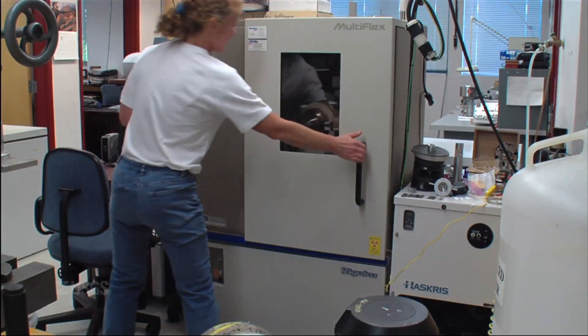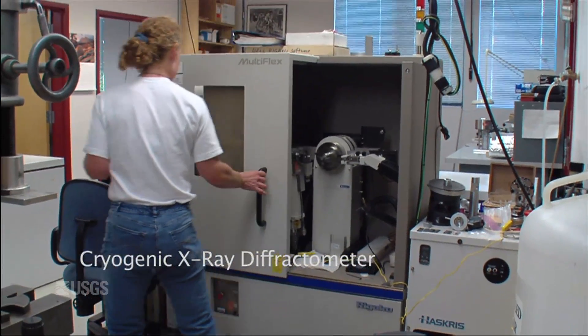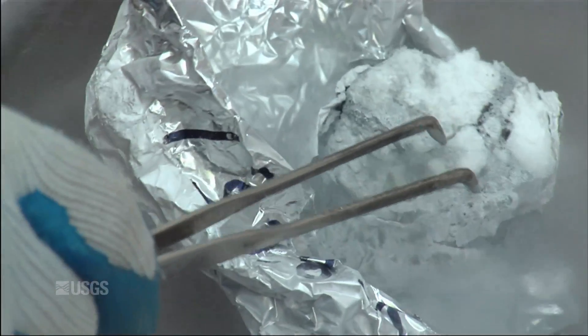We start simple — we make the pure end-member hydrates, and then we add complexities in a known fashion, so that the properties we measure reflect the individual effects of those complexities, unlike looking at samples retrieved from nature, which are so difficult to analyze.